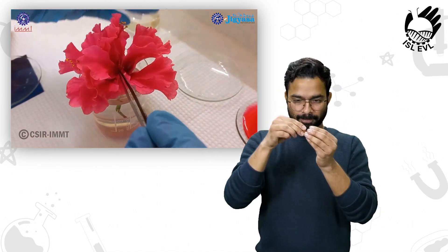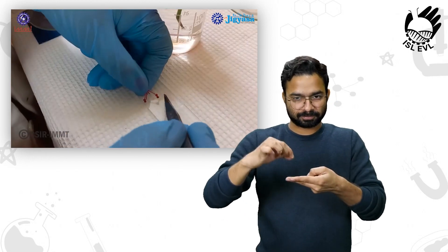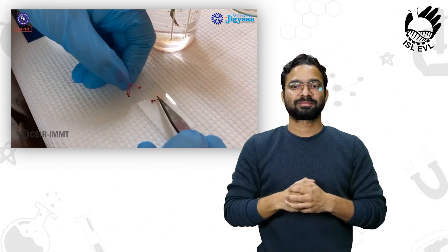First, we have to take out the stigma from the flower. Then from the bunch, we will take only one stigma and gently put it on the slide.